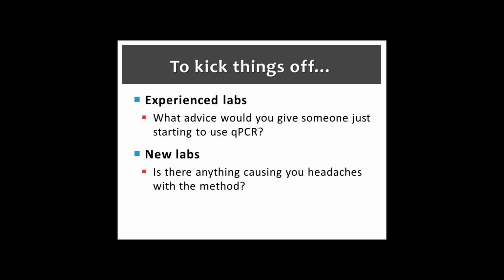Other questions? Can you come up, please? I'm not a lab person, and all this is way over my head, but the question I have, I guess this is for the experts, is once folks are up to speed on using PCR for this rapid detection, how much of a jump is it, technique or methods wise, to use it for source tracking? We're going to have Rich come back up and comment.